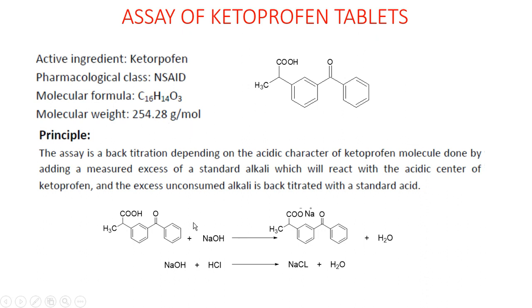Principle: this assay is a back titration depending on the reaction of excess sodium hydroxide with the acidic moiety of ketoprofen to give what? A sodium salt. The unconsumed sodium hydroxide will react with HCl to give what? Sodium chloride.